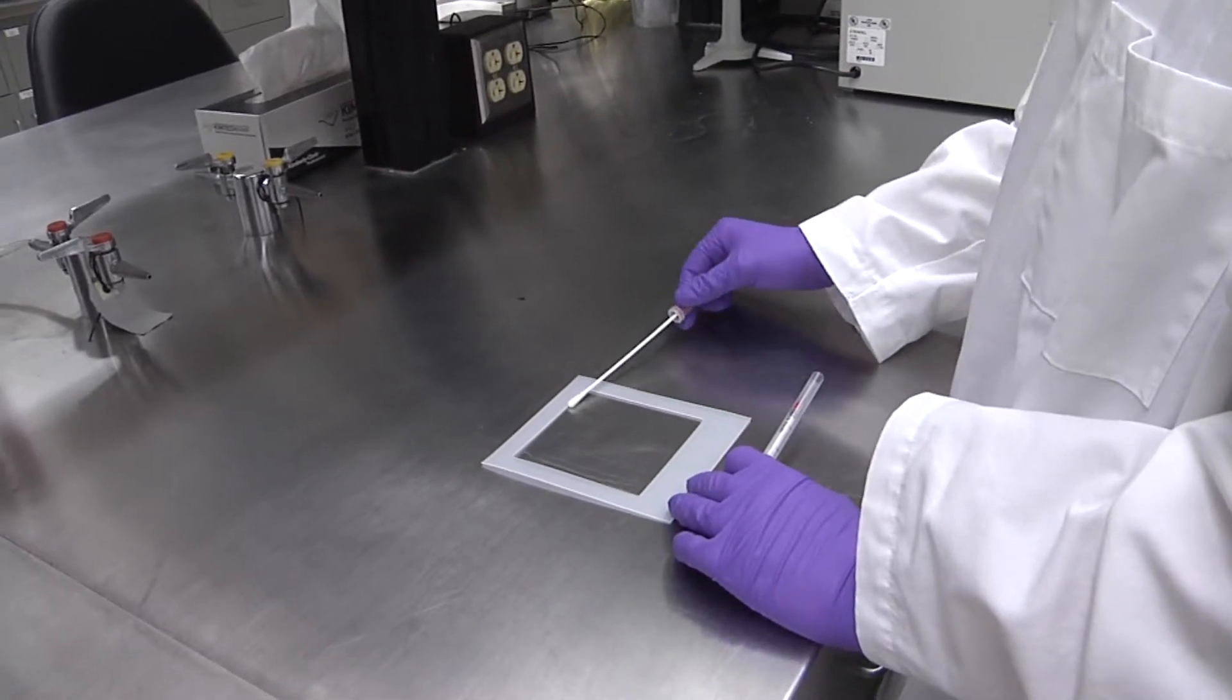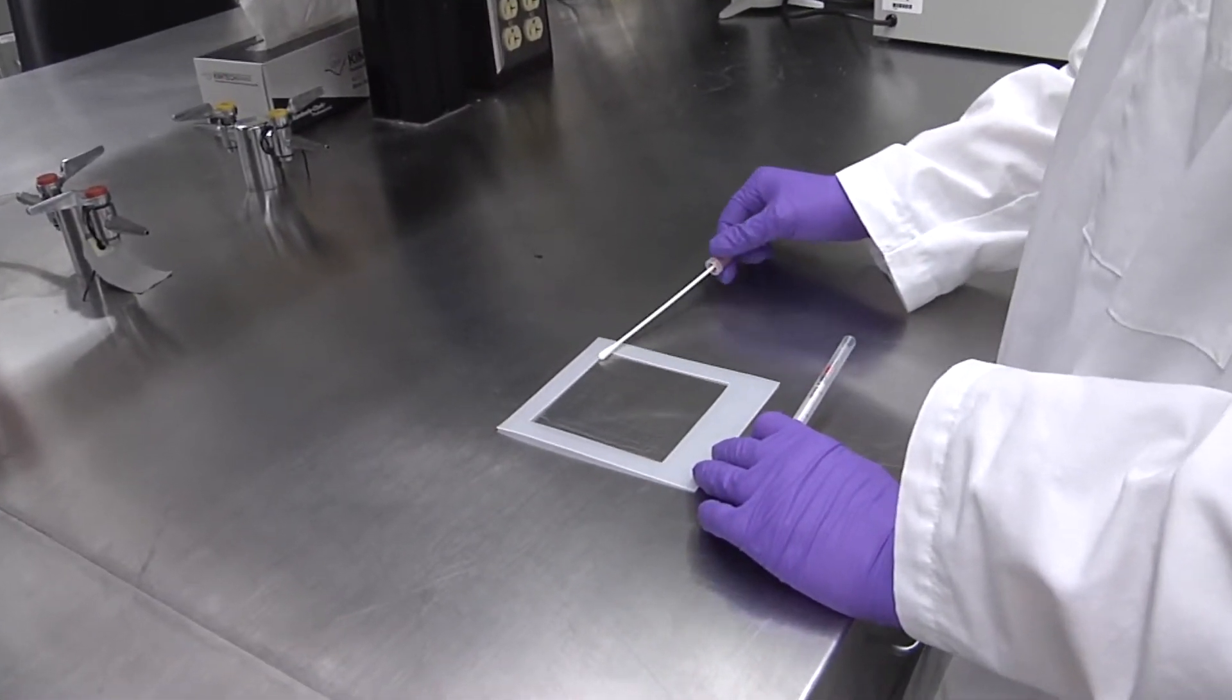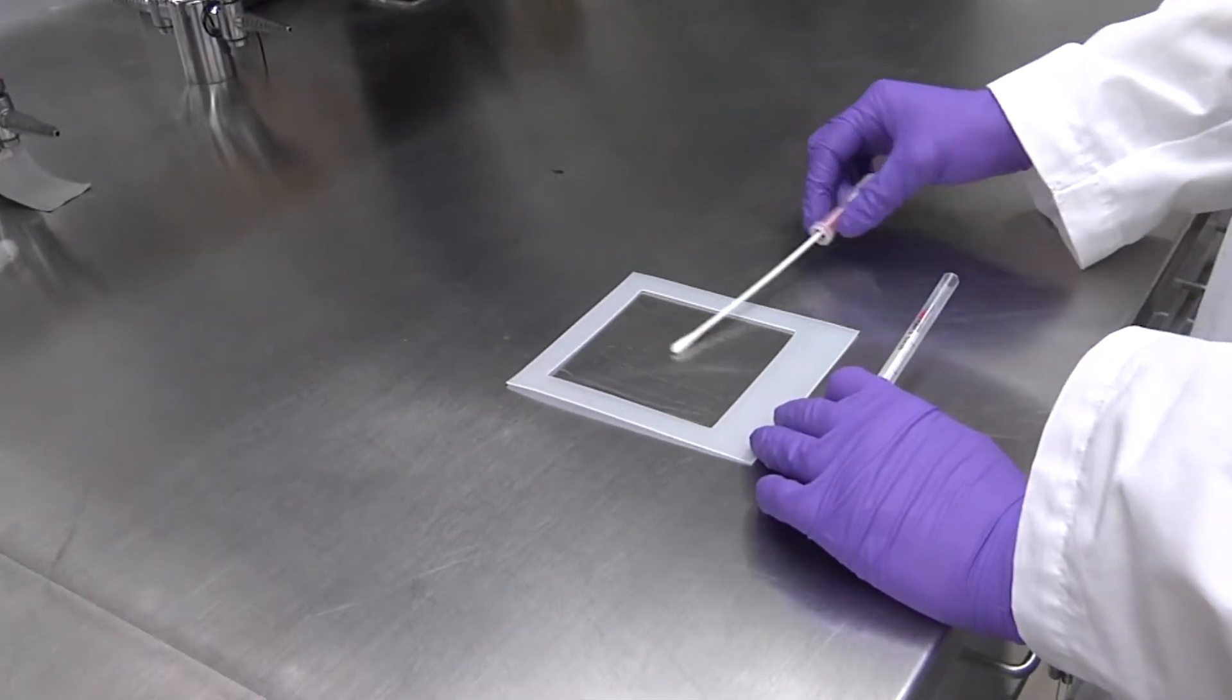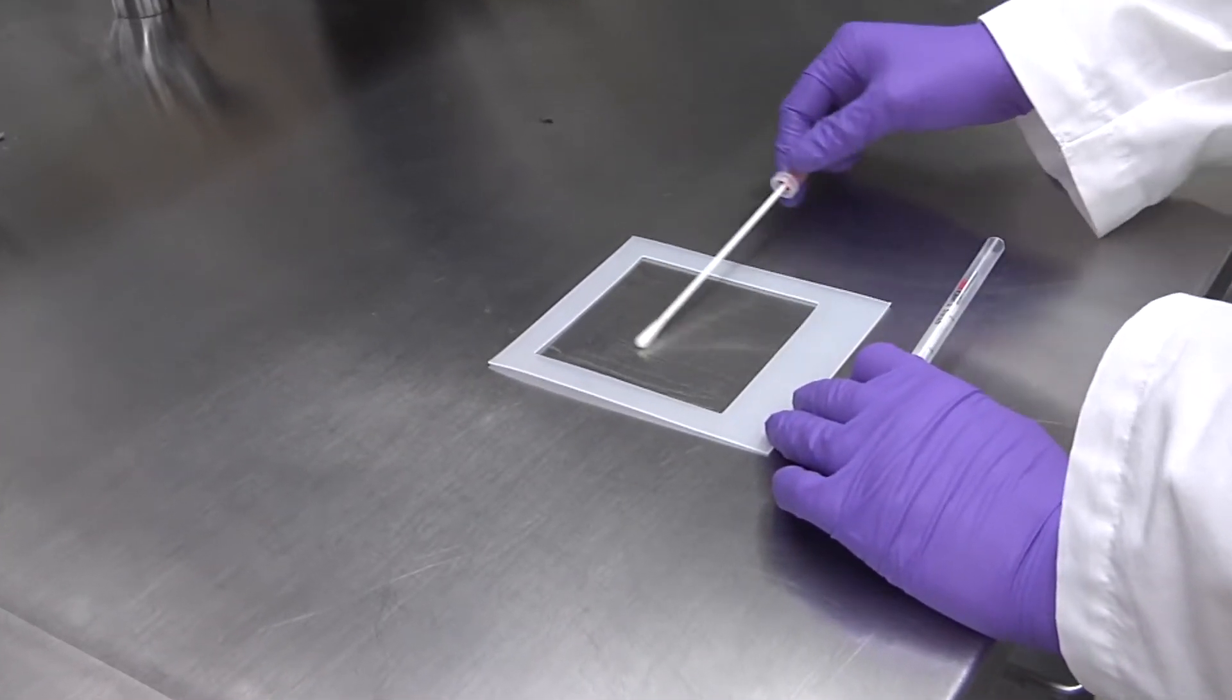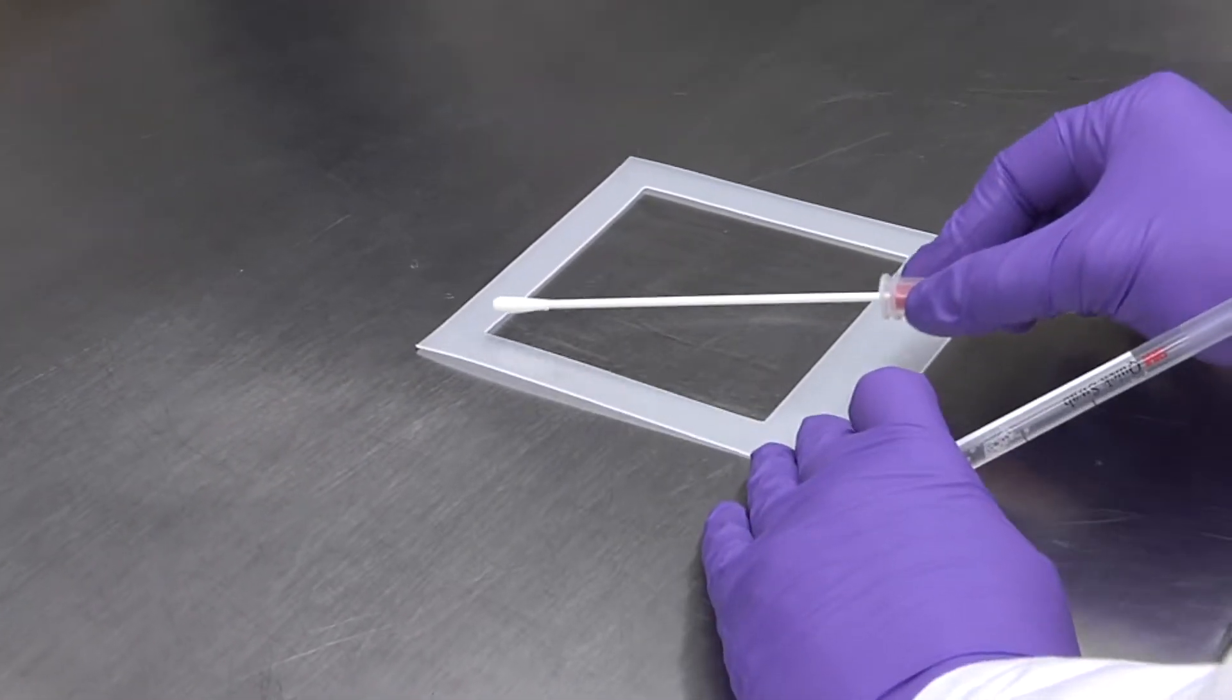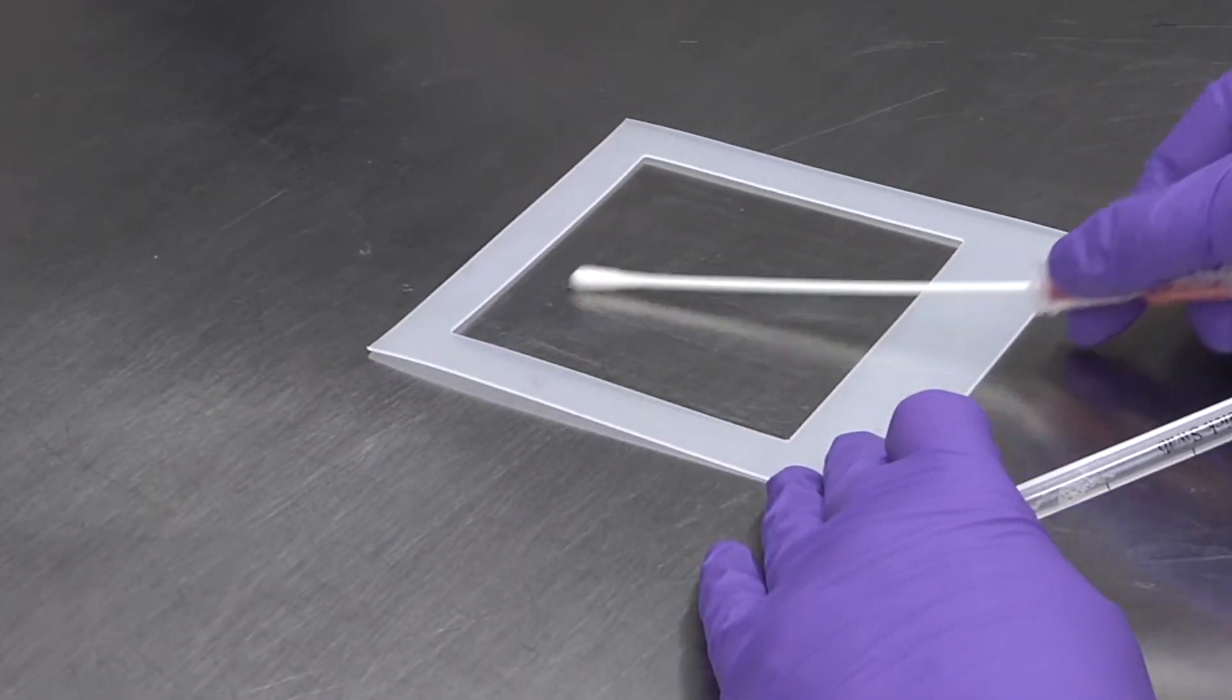As you wipe, roll the swab slightly as you go back and forth across the 2 by 2 inch area. Then you will go in the opposite direction with the same swab, perpendicular to the swab motion just made. You will be essentially swabbing the same surface twice.